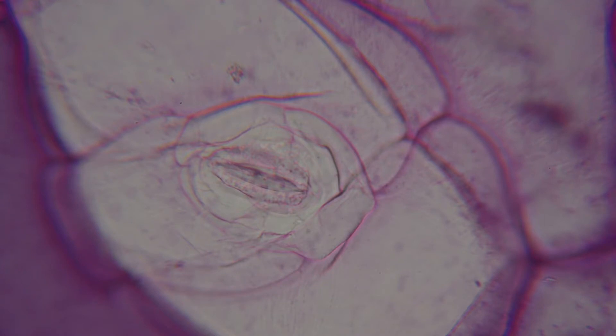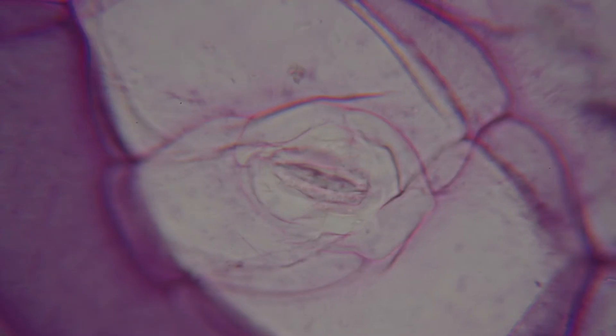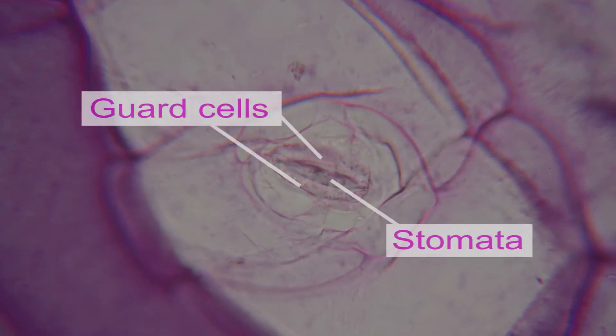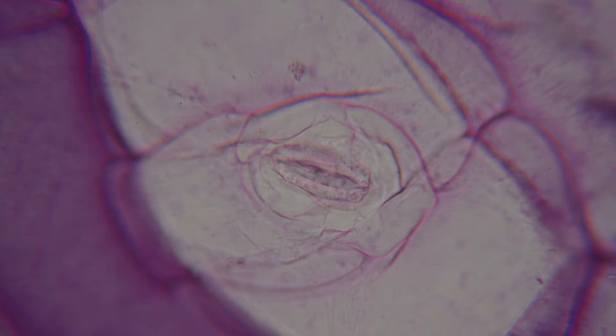The leaf has been stained and what we're looking at here in the center of the screen is this stomata. It would usually open and close, letting carbon dioxide and oxygen gas in and out of the plant as it photosynthesizes.